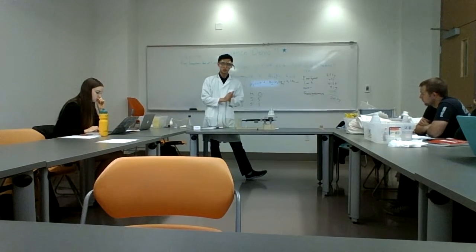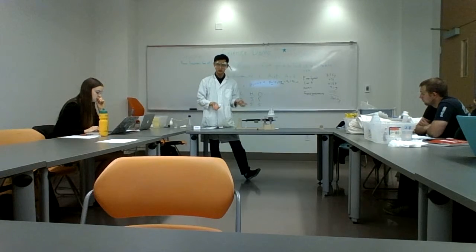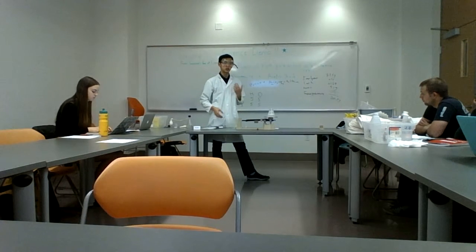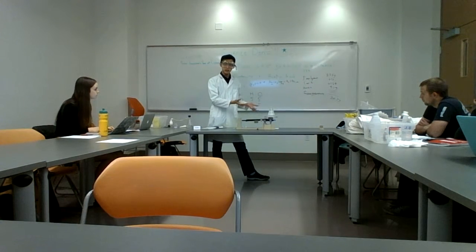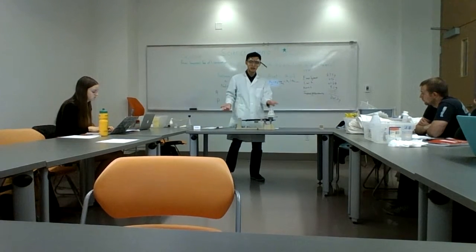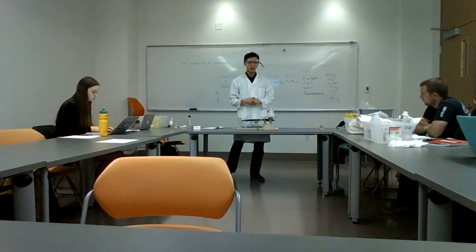So what does that say with our results for this current part one of the demo? Well, it says that maybe in the things that we experiment with, we do not always have to include that everything that is made is still in there. As we all breathe out, we see that it's making some kind of gas. Does anyone know what kind of gas it is? Carbon dioxide, maybe.